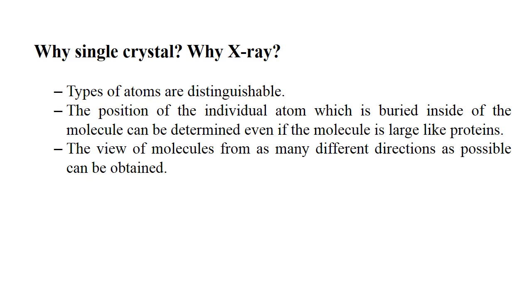If we are going to study the crystal by single crystal X-ray diffraction, we should have the three basic conditions. The atoms should be distinguishable.